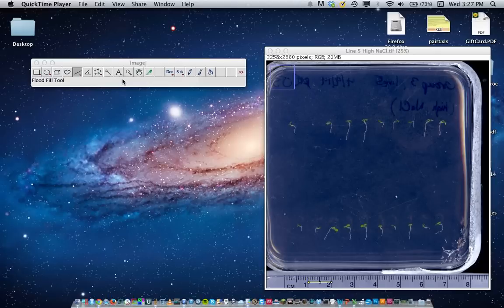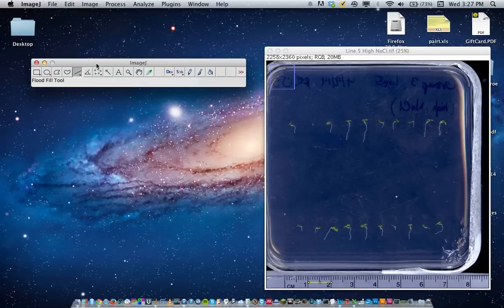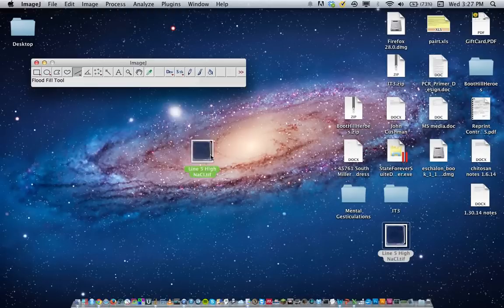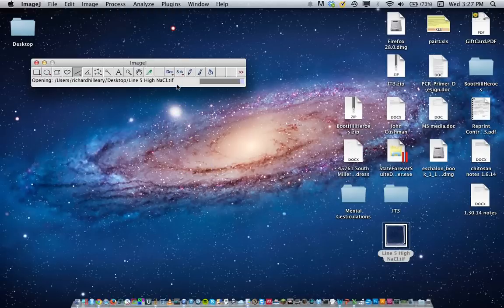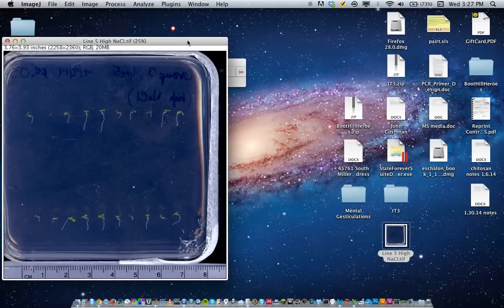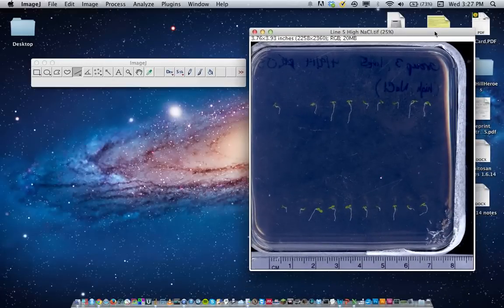When everyone does their measurements, I prefer if everyone did them in centimeters. So first, you have ImageJ opened, and then you can either through the file menu open your plate image, or you can just drag and drop it right into ImageJ. There, it's popped open right there.